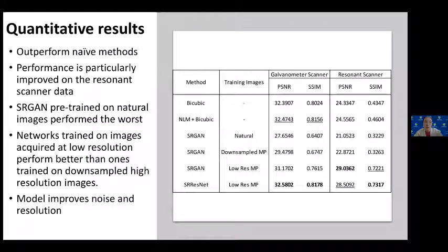So we didn't spend much time thinking about what evaluation metric we should use. We directly used the exact same metric people used for the original SRGAN network they developed. They evaluated in similar ways, so we directly used those. It may not be the best for our cases, so we definitely need to find better ways for bioimages here. Yeah, it makes sense. For example, that's been used with compressed images, right? Where you have an original, a compressed and an uncompressed.